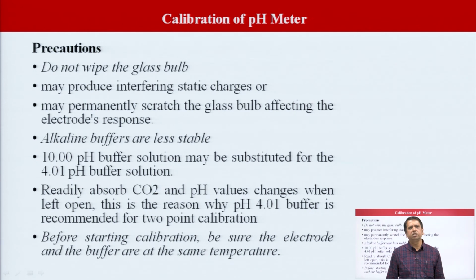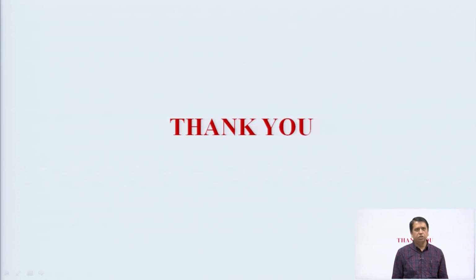And lastly, before starting calibration, be sure the electrode and buffer are at the same temperature. That we have already discussed. The temperature may change the potential of the electrode. So, this is all with the topic.